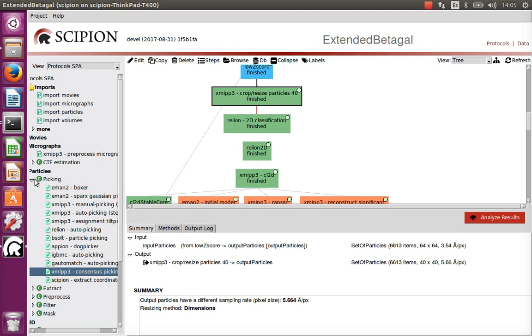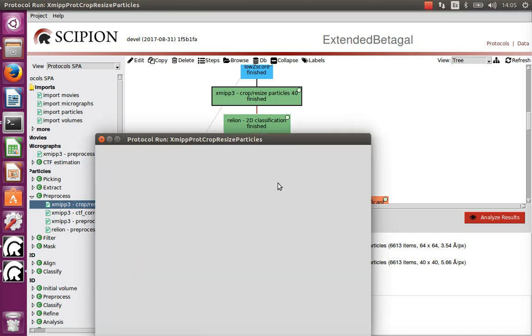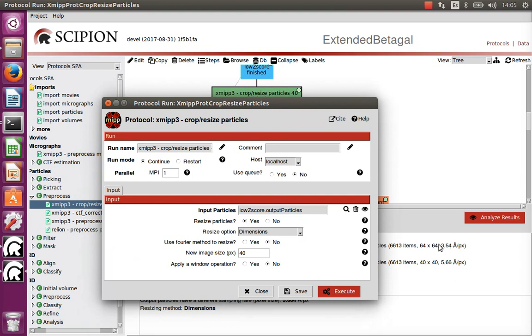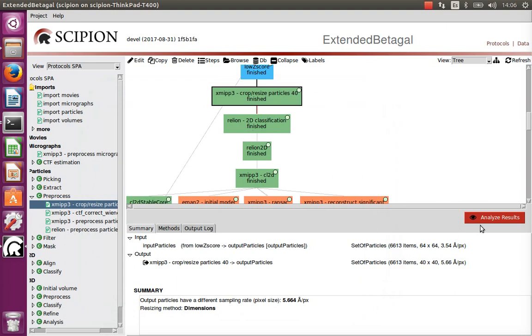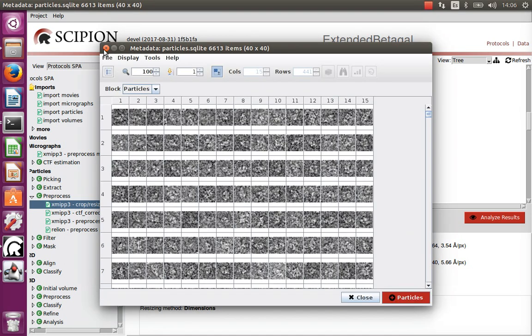The first step is to reduce the size of the images. We can do that with the pre-process crop/resize particles protocol. We have reduced the size from 64×64, which has an associated sampling rate of 3.5 Ångströms per pixel, to a new size of 40×40, consequently increasing the sampling rate. Smaller images mean all algorithms will run faster, and we have also removed a little noise, so results tend to be better when looking for low-resolution features.